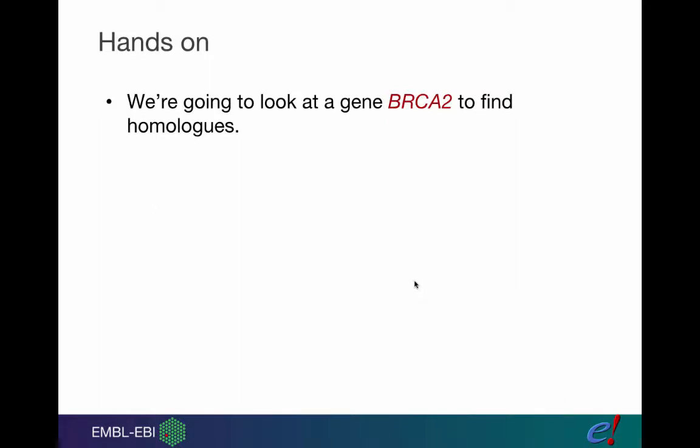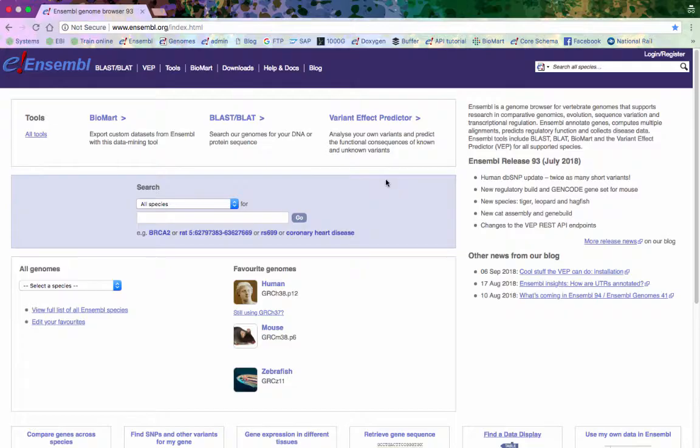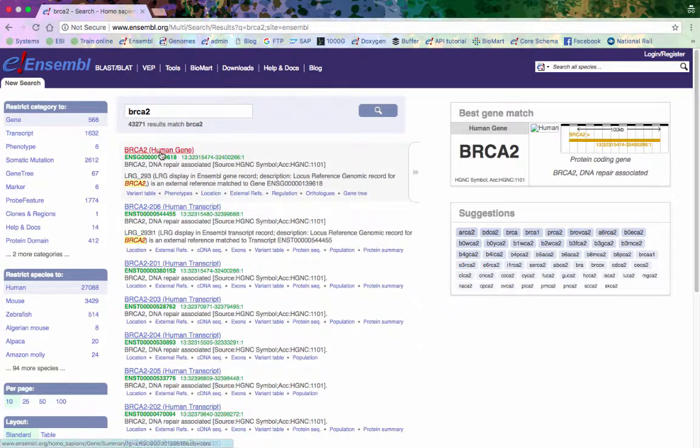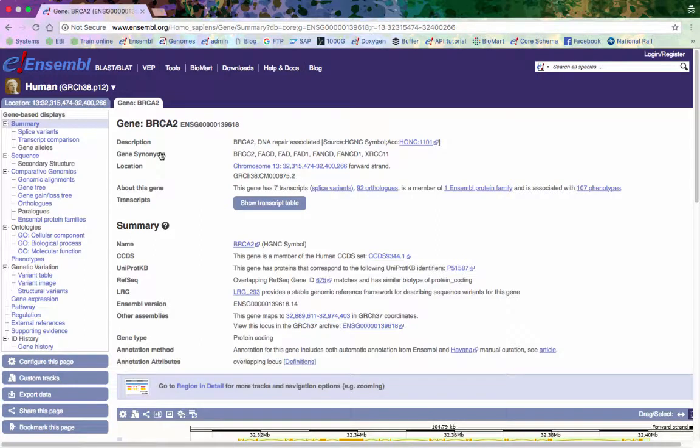So we're going to have a look at a gene. We're going to look at BRCA2 in human, and we're going to identify its homologs. So we're on the Ensembl homepage, which we've explored in some of the other webinars. So you should be nice and familiar with this by now. I'm going to just type BRCA2 into the search box and hit go, and go to my gene page.